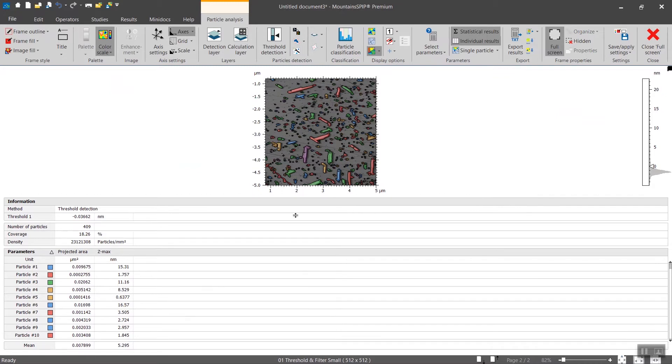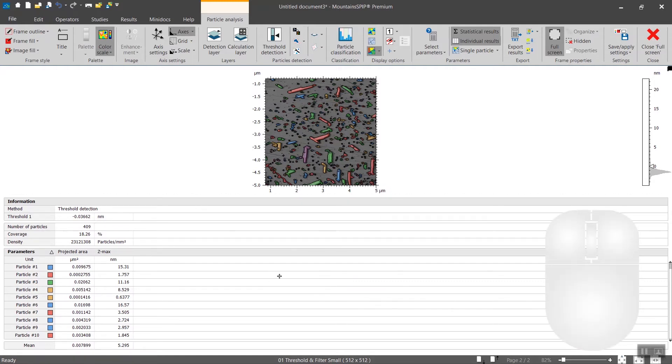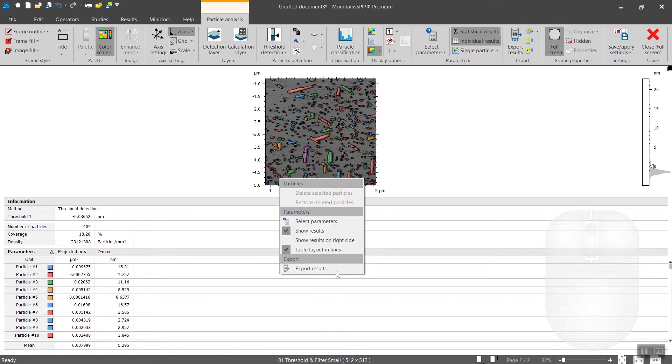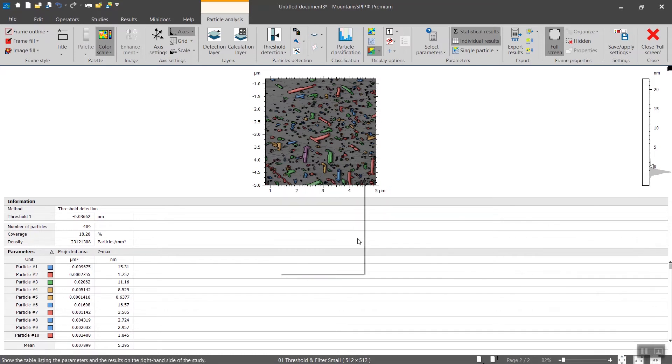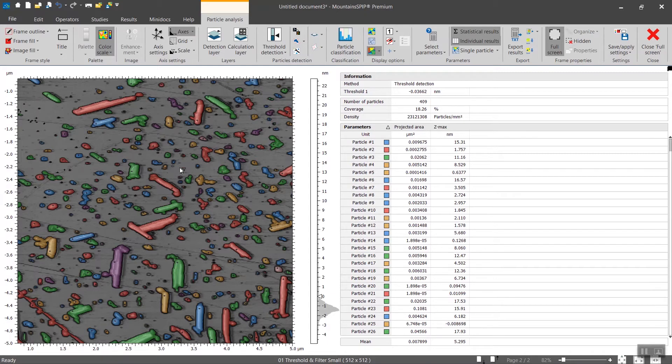You have two main components here: the structures that were detected above and a table of results below. To give more space to the first one, I recommend placing this table on the right. To do so, you right-click and show results on right side, which gives much better space to the detected particles.